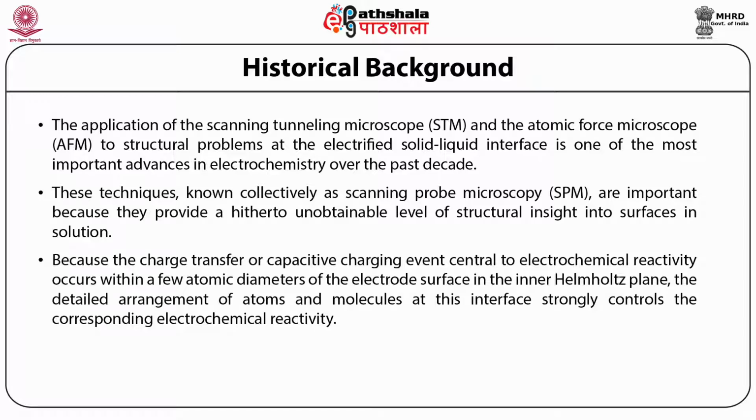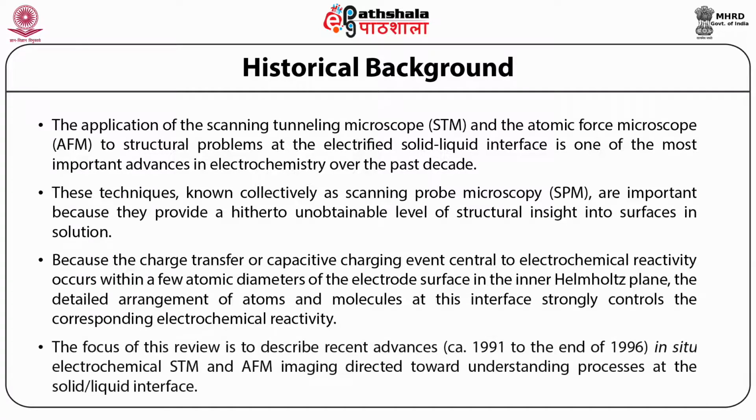the technique called STM. The focus of this review is to describe recent advances, from 1991 onwards to the end of 1996, a span of 5 years, in which in situ electrochemical STM and AFM imaging directed towards understanding the solid-liquid interface is elaborated.